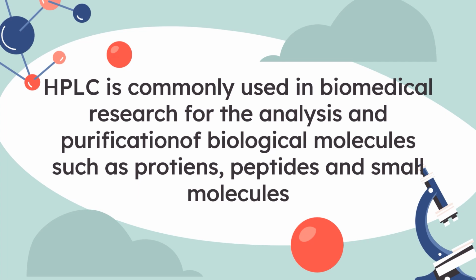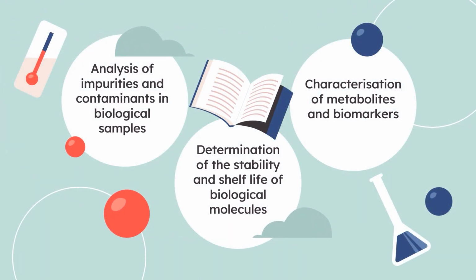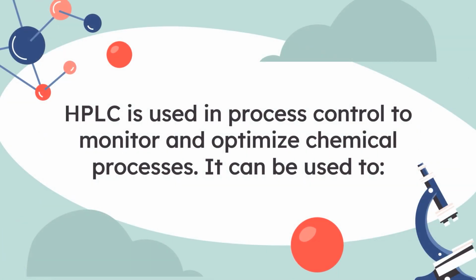HPLC is commonly used for biomedical research for the analysis and purification of biological molecules such as proteins, peptides and small molecules. The second application of HPLC is process control.